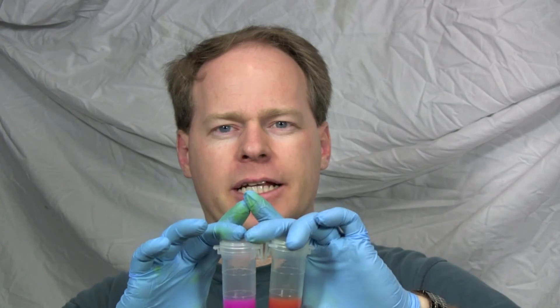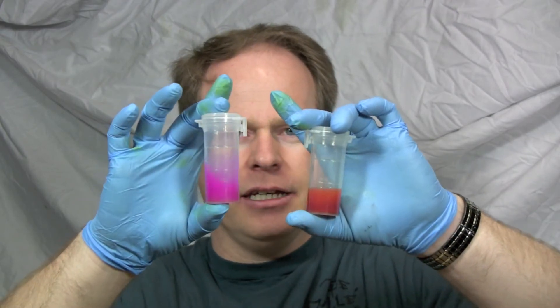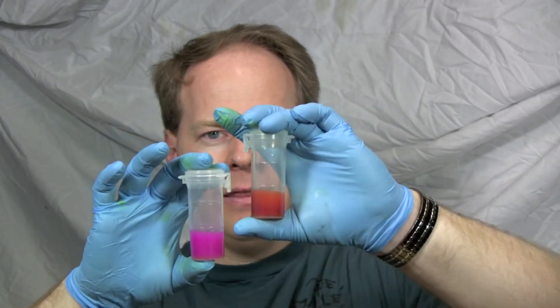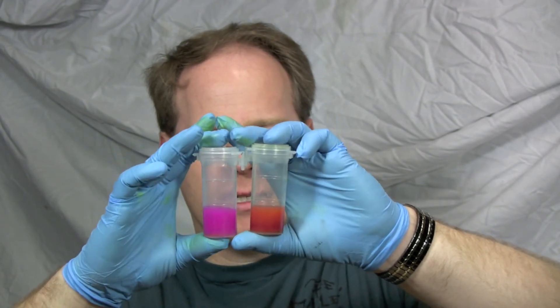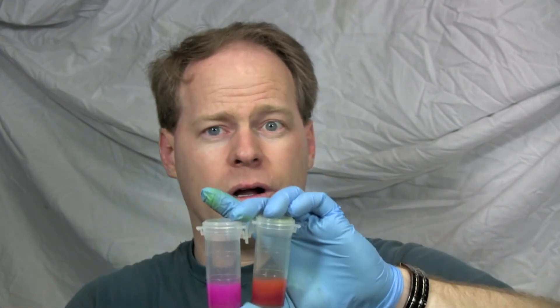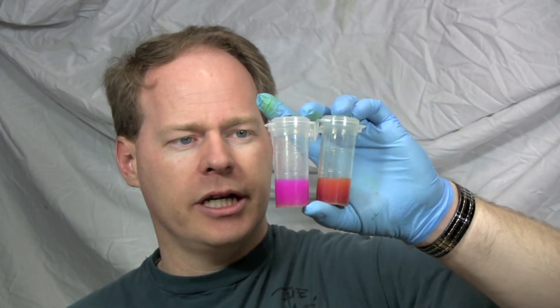I redid some titrations. This is phenolphthalein, and this is turmeric — much, much deeper, darker red than this light-colored pink. Both of these are okay to use to do titrations with.